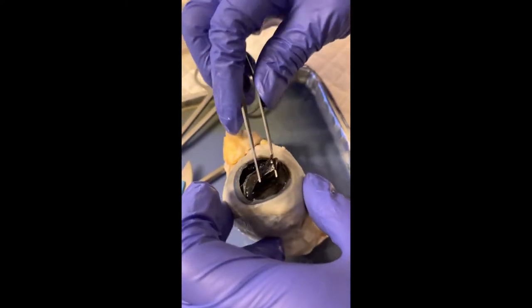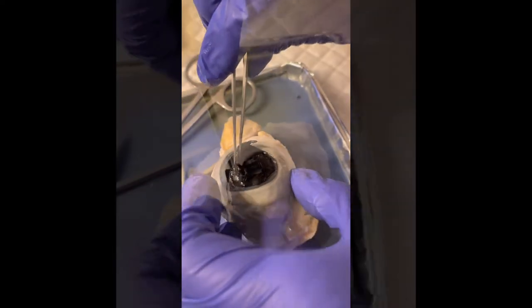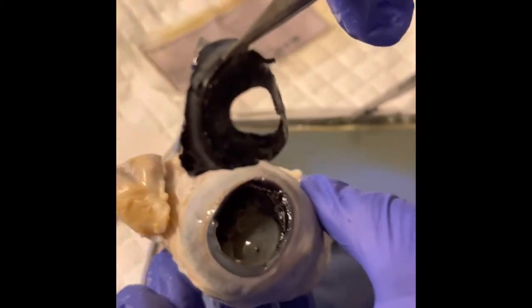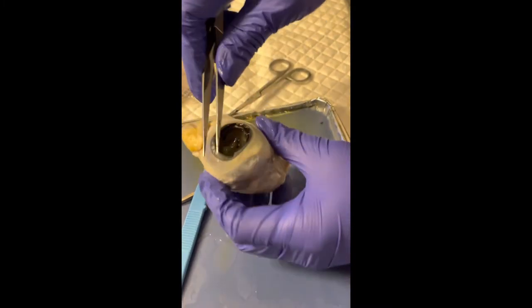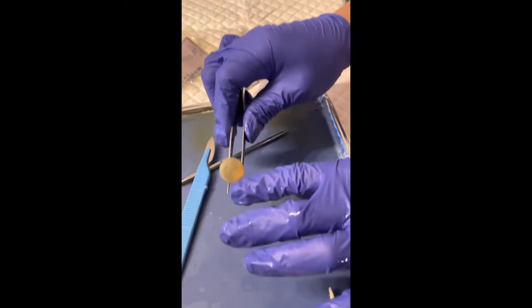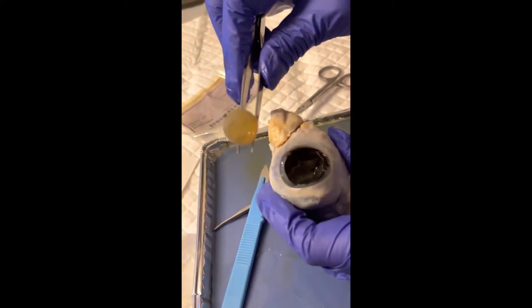Next, I will move on to the removal of the lens. This is another clear and fragile part of the eye. I found the best way to remove this lens was with a pair of tweezers, again with a gentle scooping motion. The lens should pop right out and almost resemble a sack-filled little marble. The job of the lens is to focus on light that is the actual remaining 20% of whatever the cornea did not cover.